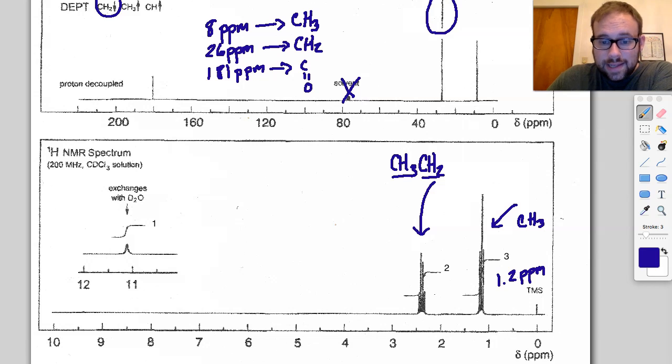You can see that this CH2, the methylene, is much further downfield than regular CH2s would be. A lot of times CH2s are going to show up maybe somewhere between 1.2 to 1.4, 1.5. This one is showing up at approximately 2.4. In order to get a push that far, you have to be next to an electron withdrawing group to get that sort of deshielding effect that pushes it downfield, and 2.4 is right around where carbonyl would show the deshielding effect. That's exactly what we would expect.